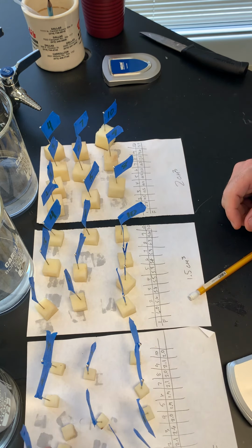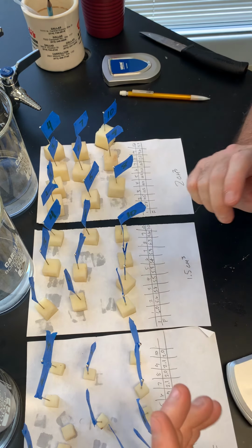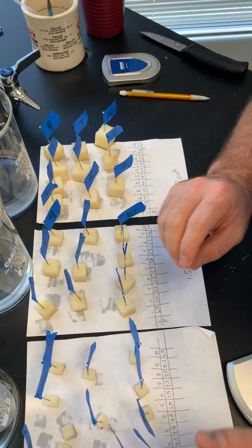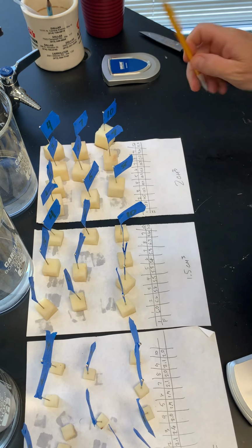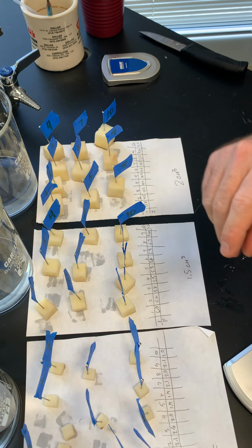Now what I have to do is get them into the solution. And I need to do it close to being the same time. It's going to be hard for time to be an absolute constant. I'm going to have to do it pretty quickly, but I don't want to do it where I knock off my little flag. So I'm going to take these now. I'm going to set a time. The time is 1:50. That's when I start my trial, at 1:50.